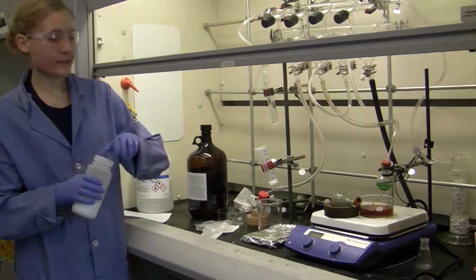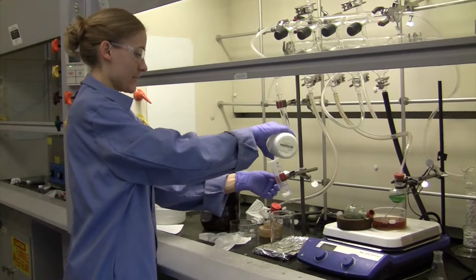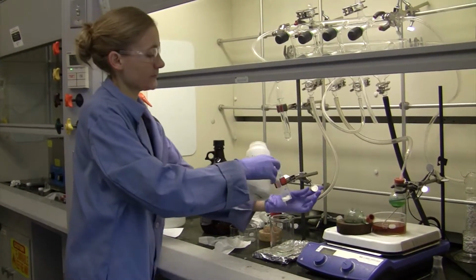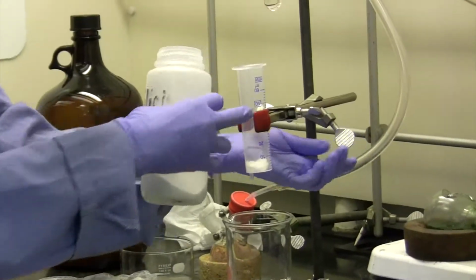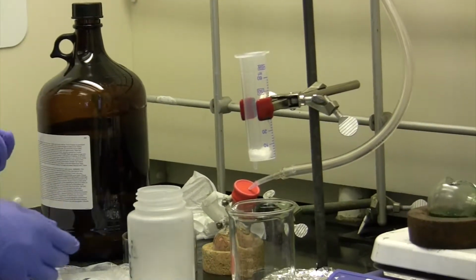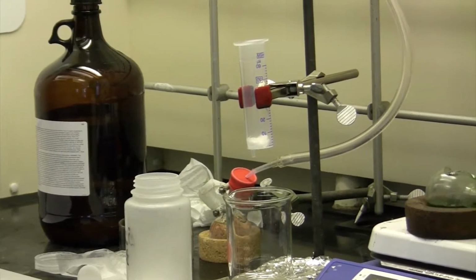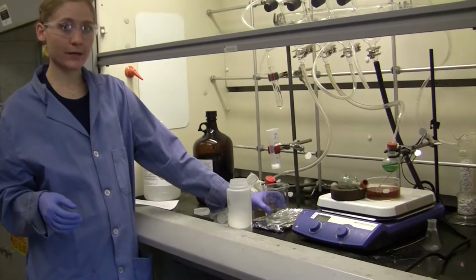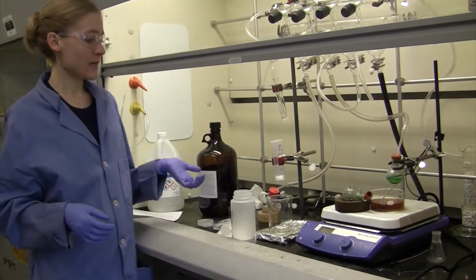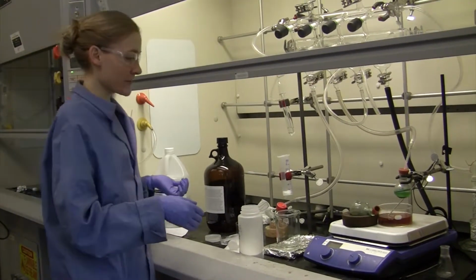Once you're sure that your cotton's not going to move, you can add in your silica. You want to be pretty careful about that, because if you get silica in your polymer when it comes out the other side, you're going to have to run the column again. And so you want to do it right the first time.